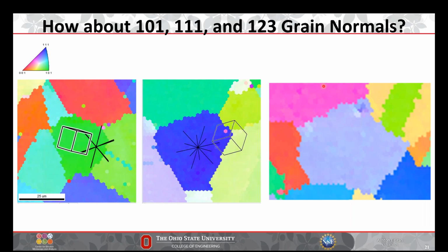And so I've also done this because we check the other grain orientations to see what type of deformation modes we have active there. That's a little beyond the scope of the talk. But in terms of physically how we're doing this, it's the same, right? We can draw a cube and the traces of, in this case, 011 type planes, and then do this for, say, the 01 or the 101 type or 111 grains. And that might seem intuitive.